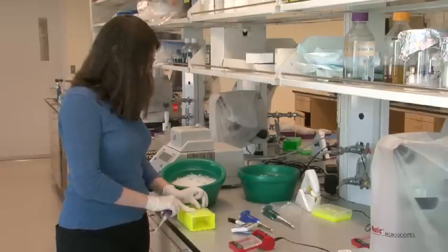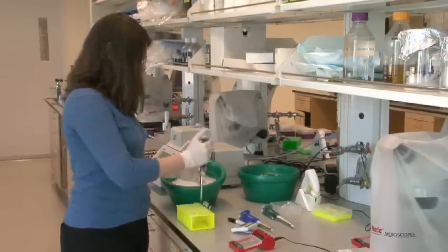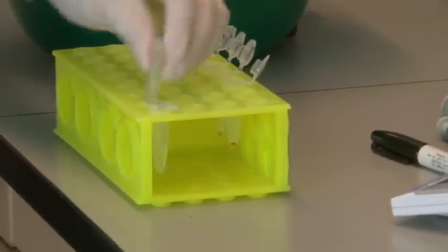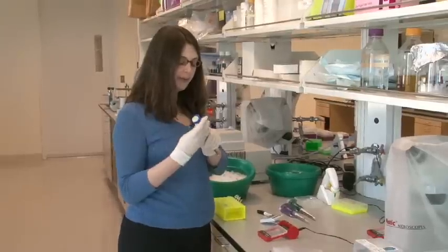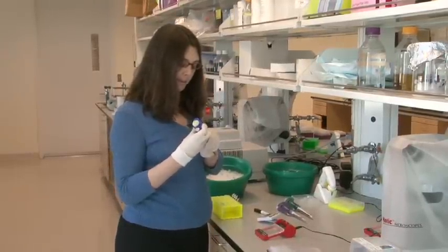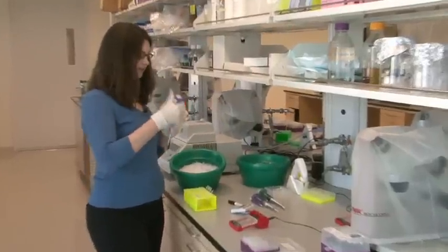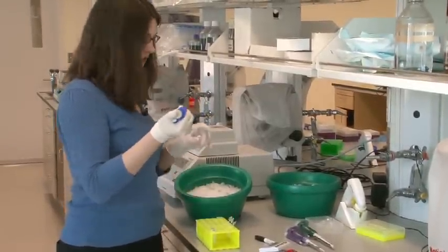So the first thing I'll do is transfer a small amount of orange dye into each of the tubes that I'll be placing the DNA samples into. You can see this orange dye in my pipette tip. It's just a colored substance that we can see with our eyes. DNA is transparent, so we can't see it with our eyes. Okay, so now I'm going to be transferring a small amount of each sample into those tubes. So here's my PCR reaction. I place it in the tube to mix with the orange so that now we can see it.